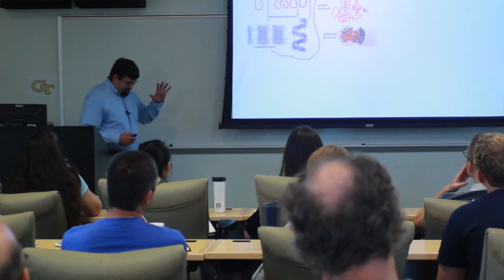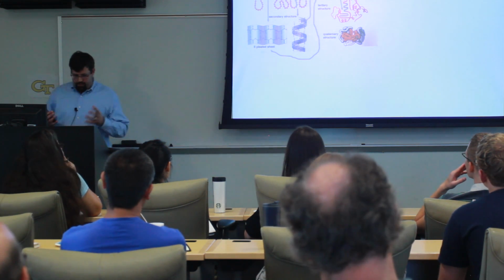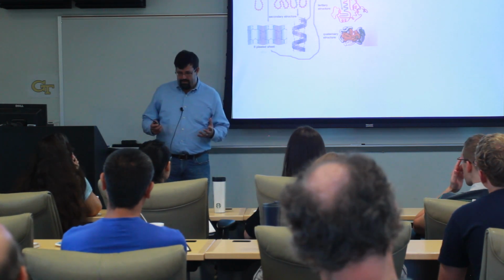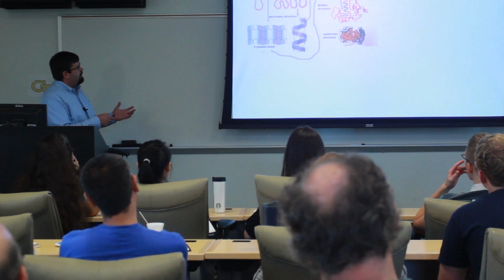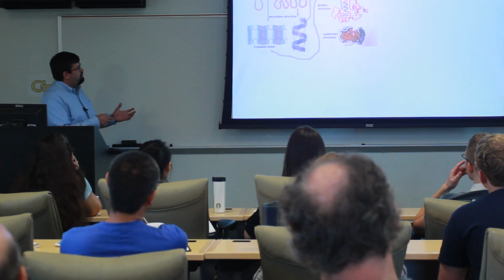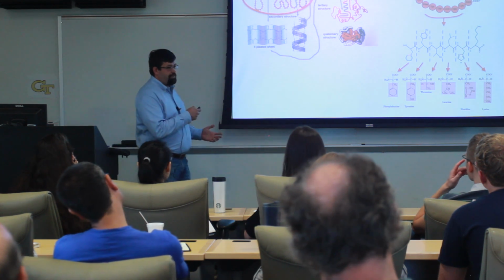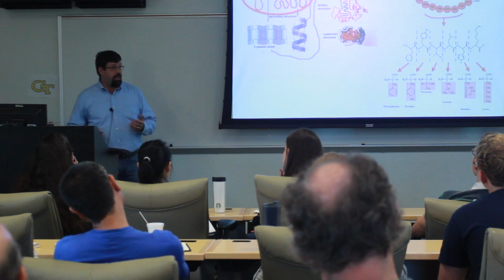Before we get into it, let's think about what exactly we want to do. We want to identify a protein, say a protein that comes out of a gel from a band that's stained with Coomassie. We don't know what it is. Well, first off, of course we do know that proteins are identifiable by their primary structure. Right? So proteins have a primary structure, which is their sequence of amino acids in a polypeptide chain.